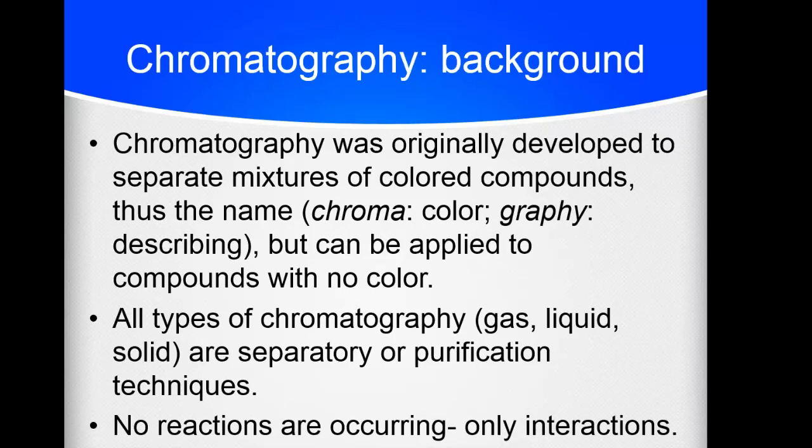So you can do it in a variety of different phases. You can have gas chromatography, you can have liquid chromatography, you can even have gas-liquid or liquid-solid chromatography. In all cases, only interactions are occurring, not reactions. So you're not reacting your compounds together, just like they're not reacting in the mixture. You are separating your mixture via physical means, as is typical, and your mixture was combined physically. So it kind of makes sense.